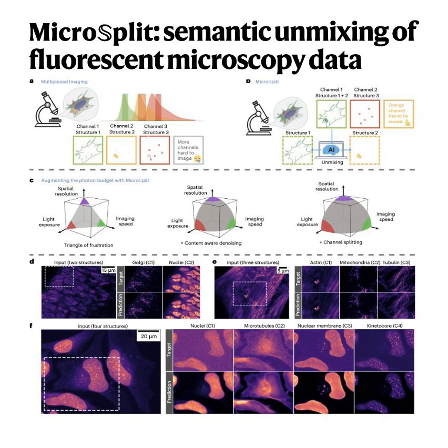They used the HTLIF24 dataset, imaging the nucleus, the microtubule network, and kinetochores. Those are the tiny protein machines that pull chromosomes apart, for anyone who might need a refresher. Right. So they fed MicroSplit an incredibly brief, very noisy 2-millisecond exposure. An exposure time that would traditionally give you a practically useless static-filled image. But the network took that single 2-millisecond exposure, unmixed the 3 structures, and denoised it so aggressively that the final output was actually higher quality than a raw image taken with a 5-millisecond or even a 20-millisecond exposure. It completely outperformed the standard baseline.